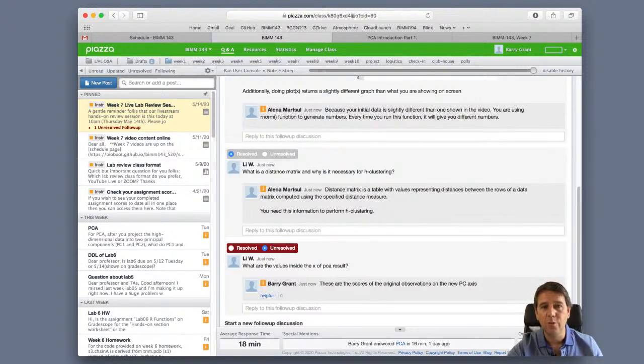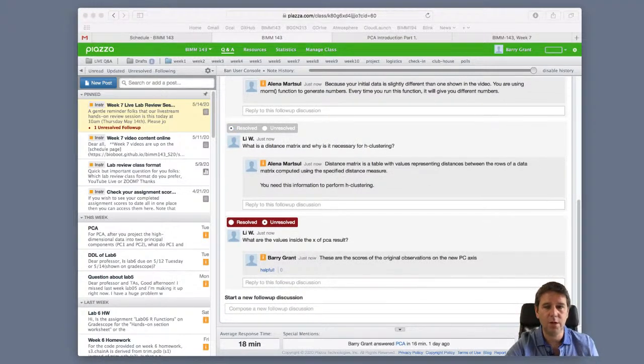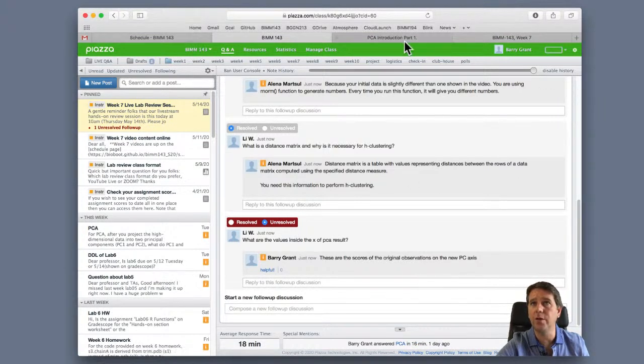We'll see that PC plot. Okay, if you wanted to plot PC1 versus PC3, we could do that too, but we'd use the number 3 there to access the third column of that data set. Okay, so with that, I'm going to pop back over here and we'll see.